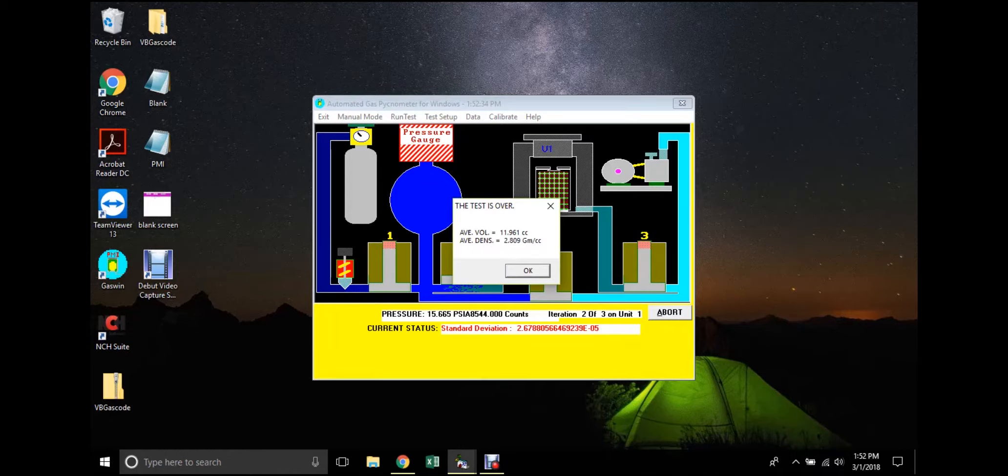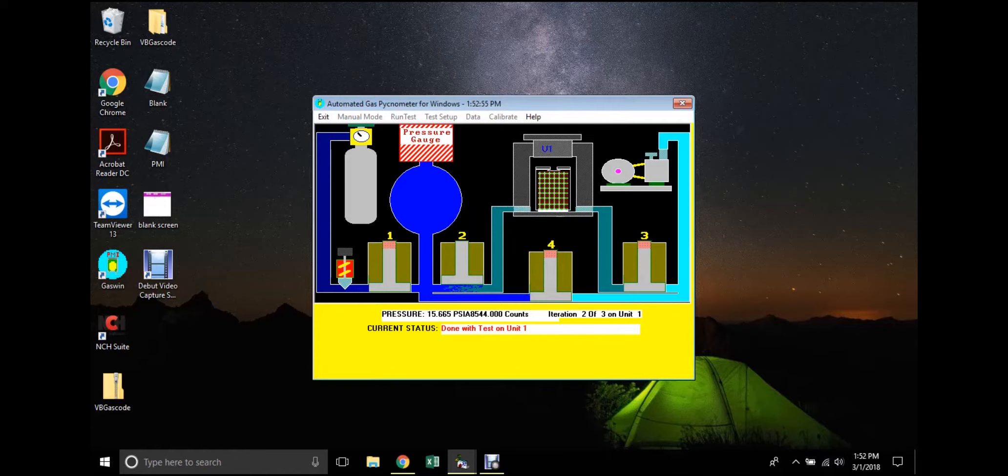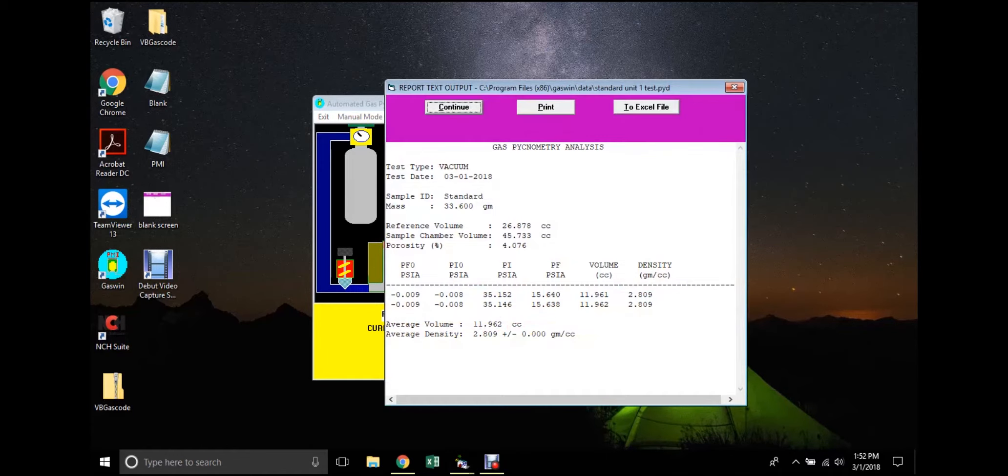When the test is complete, a prompt window will appear displaying the volume and density of the sample. When OK is clicked, the software will generate a report. This will display more detailed information about the results.